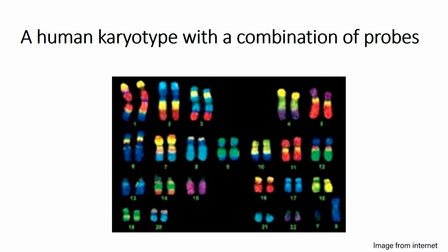Now, the question is, if we can do karyotyping at the molecular level, will such karyotyping be much better than G banding, much better than other banding? Can we replace them? That is the next question. The answer is not at all, because every technique has its own limitation. And as I said, G banding has been followed for nearly 100 years, if not 100 years, then 80 years or so.